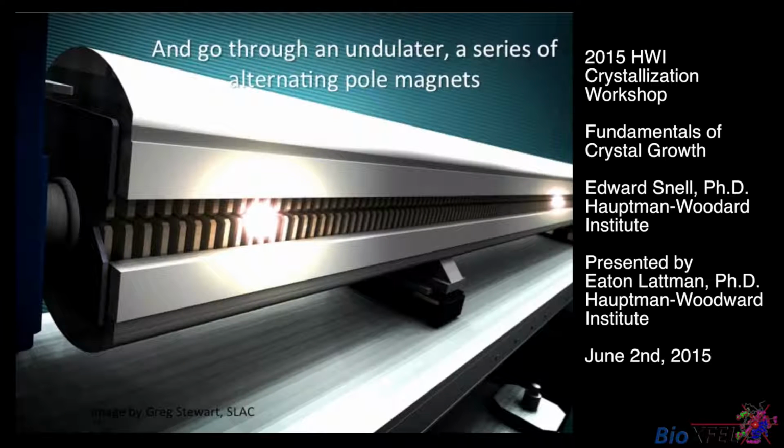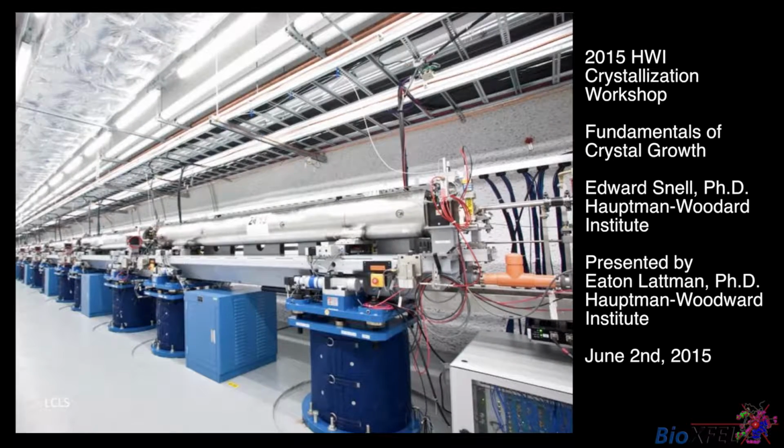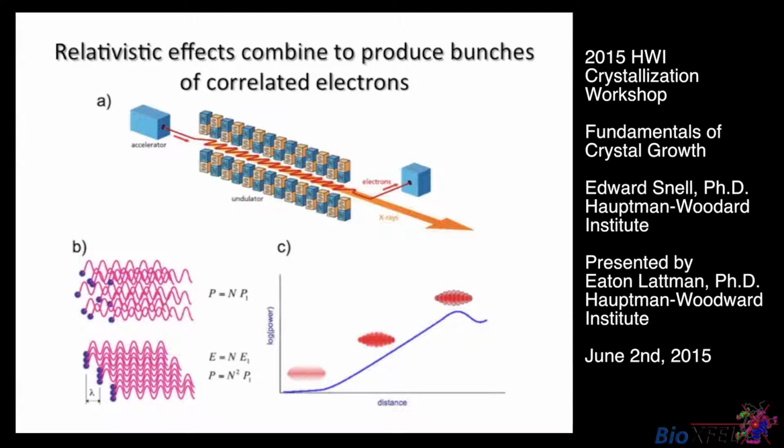And this is the sophisticated version of magnetic arrangements that produces the X-rays and the X-ray lasers. The electron beam will come in through this gap. These are paired magnets, north-south, the next one is south-north, north-south, south-north. Here's a picture of how they're organized. Here's where it appears. Let's look a little more closely at this.